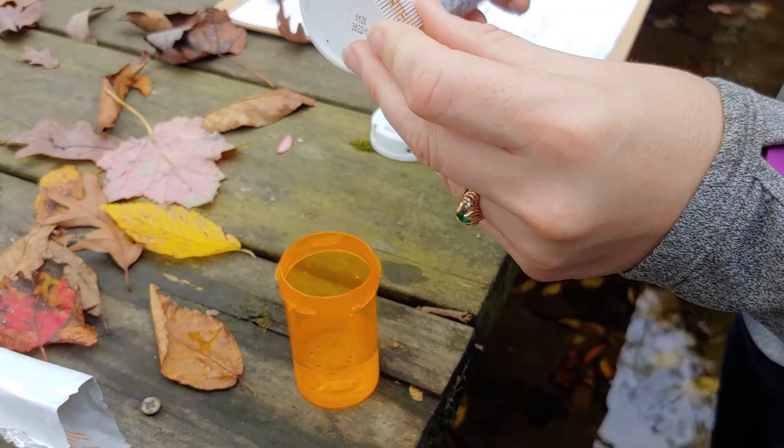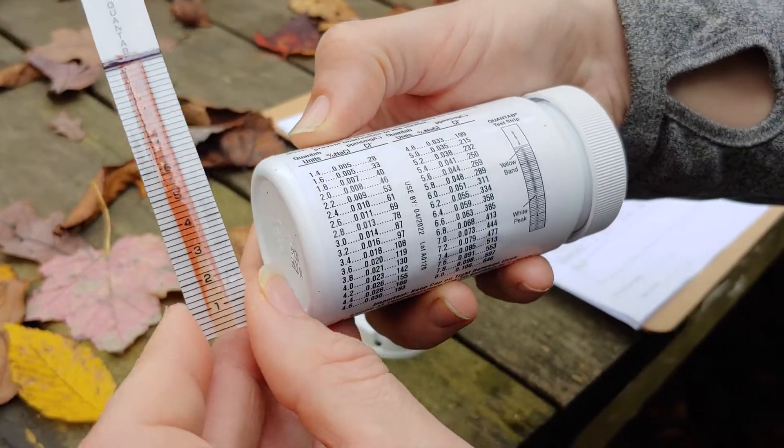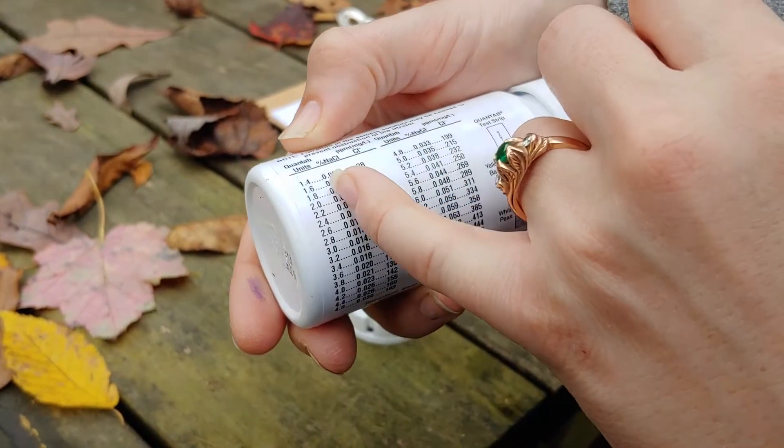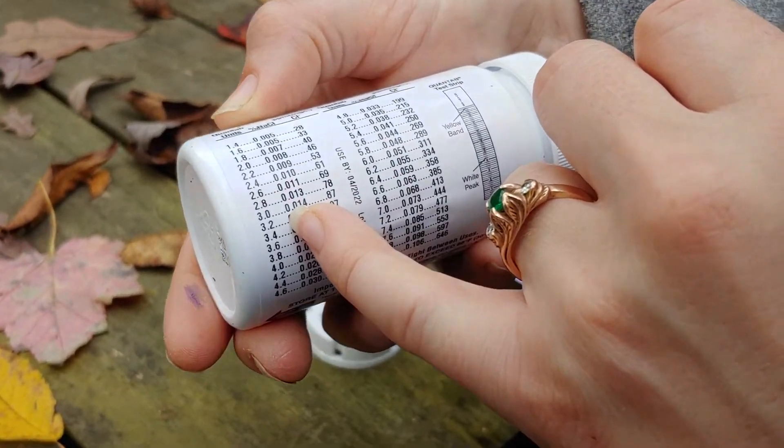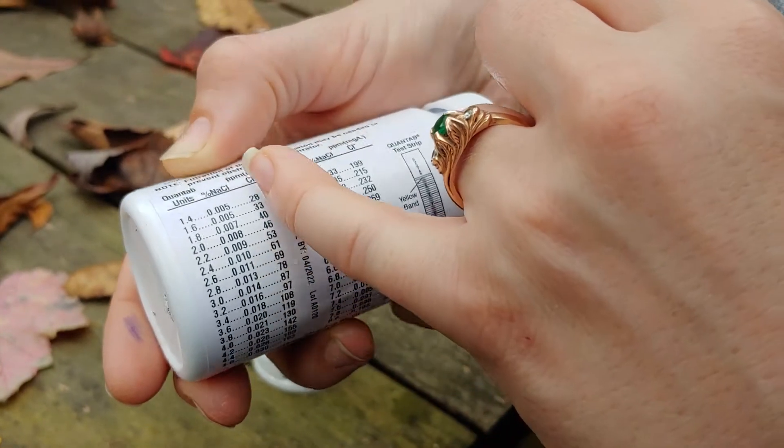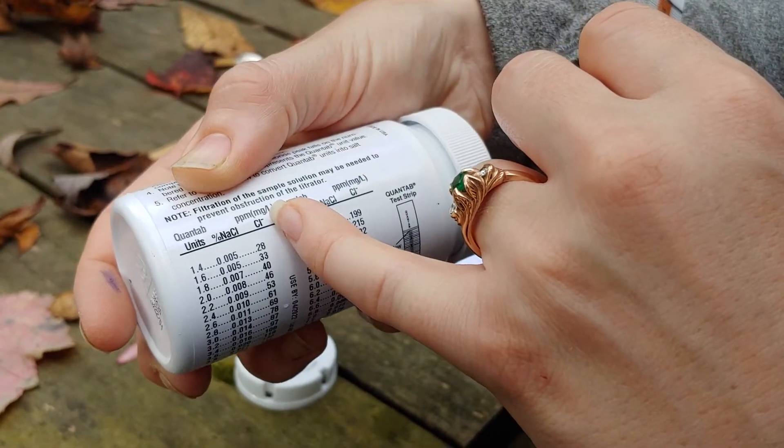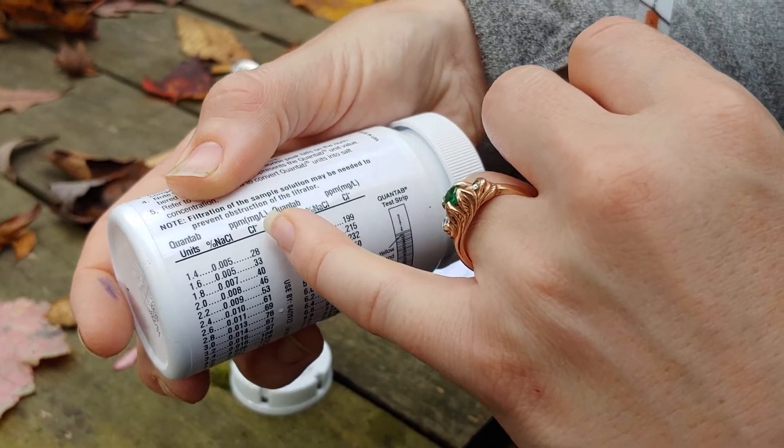So what that means is we're going to come over here to our bottle or sheet that has the conversions on it. So we are at 3.2 Quantab units, which means there's 0.016% sodium chloride and 97 parts per million of our chloride ions.